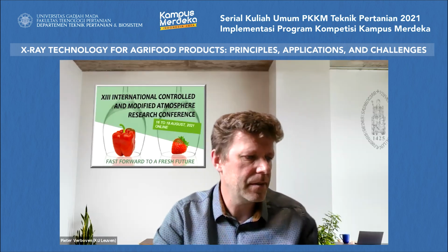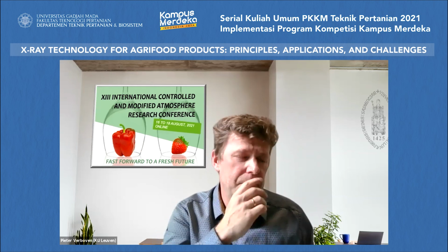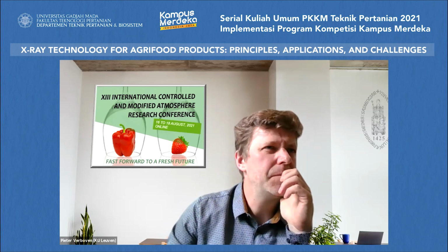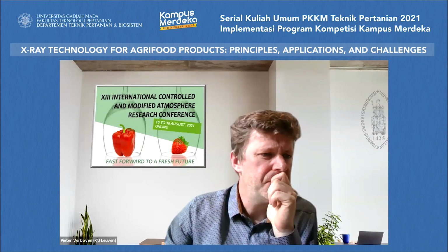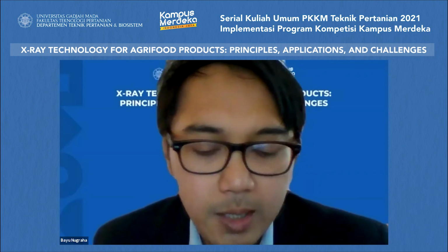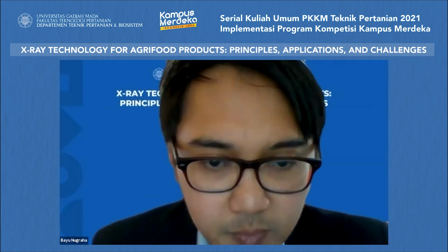Okay, thank you very much, Peter, for your very nice presentation. Now we can see the applications, how powerful X-ray is for identifying the internal structure of the fruits, and also the use of X-rays for generating the 3D macrostructure and also microstructure of the fruits, which can then be used for gas exchange modeling and other applications. And now we have some questions from the audience, and I will read the questions.